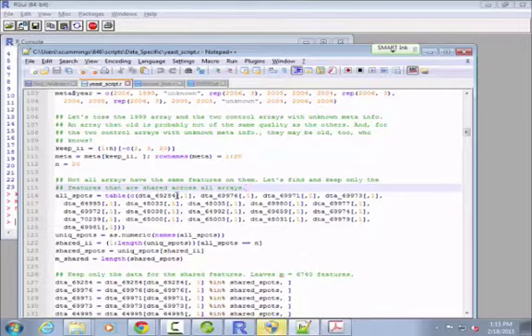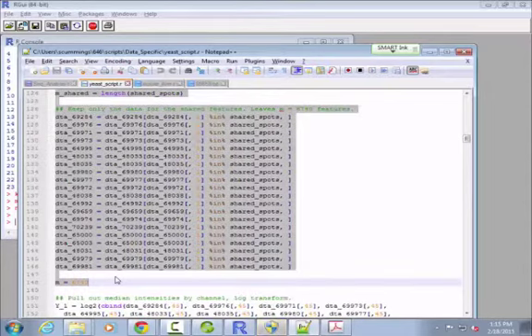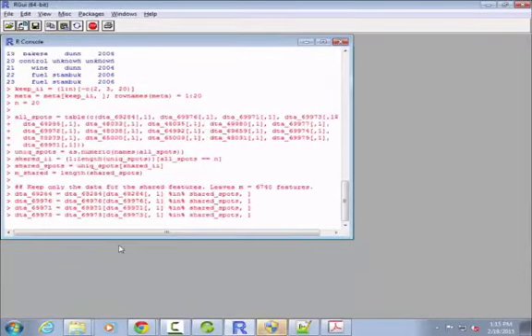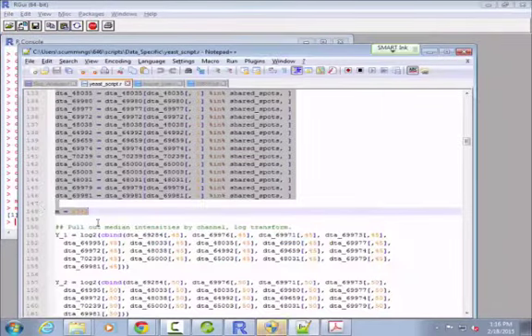In order to simplify what we're going to do, I'm only going to focus on the spots that are the same across all 20 remaining arrays. So that's what I'm doing here. I talked about this on Friday. I'm just pulling out the spots that are common to all of the remaining arrays. There's now 6,740 spots that are common to everybody. So each one of these data frames has 6,740 spots. And I'm going to put them all together into a 6,740 by 20 matrix of intensities.